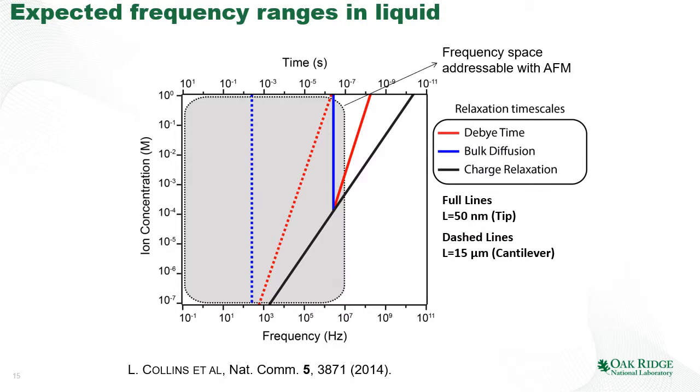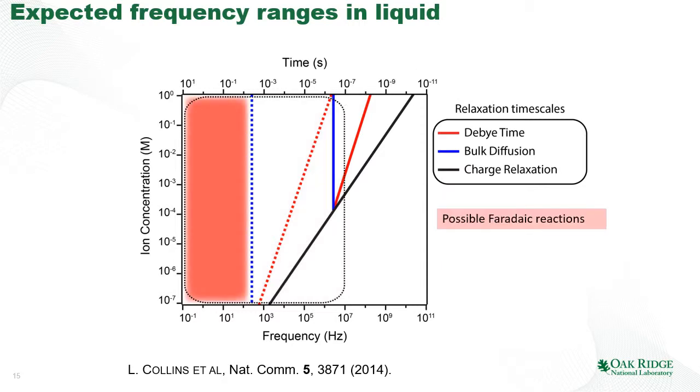So in comparison, this is the frequency range which is of interest for KPFM. So we are being generous, and we say that we're interested in frequencies from hertz all the way to megahertz and slightly higher. Higher than that, we start to have problems with the cantilever dynamics and photodetector and so on and so forth. Now, we also assume that we operate at relatively high biases, so of the order of, say, volts. So here we don't plot the voltage dimension.